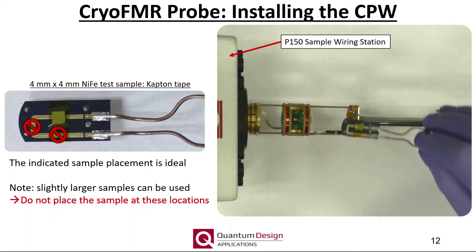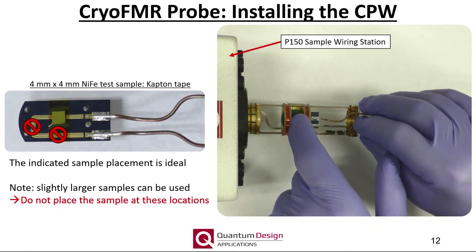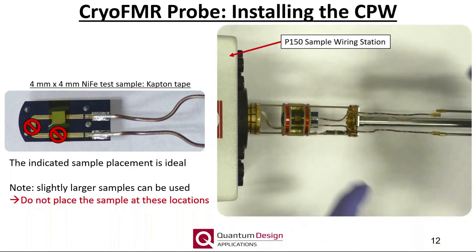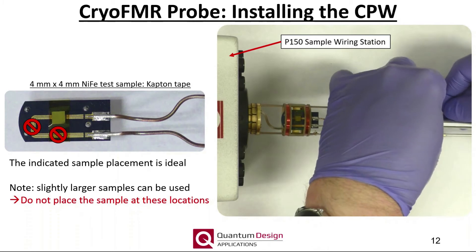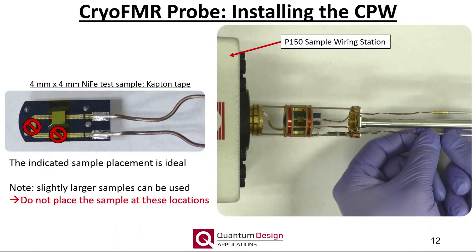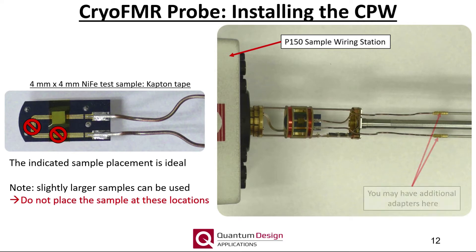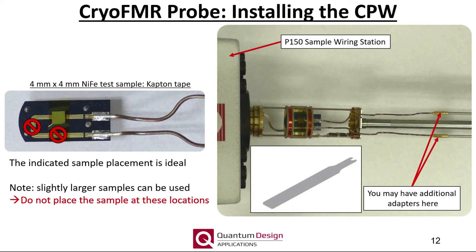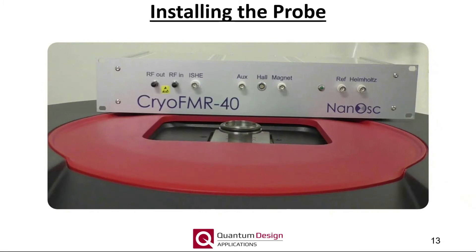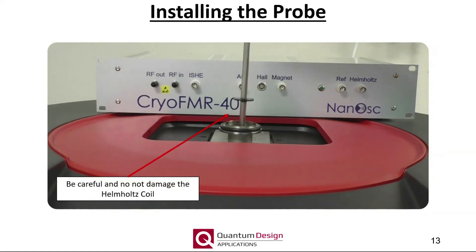Gently insert the 4 alignment pins in the coplanar waveguide into the sample platform of the cryo-FMR probe, as shown. Once firmly in place, connect the two SMPM connections, and then give all of the connections a double check. Note, depending on the vintage of your coplanar waveguides, there may be an additional adapter located here. To disconnect these SMPM connections, feel free to use the included tool, shown here, to gently pry the connections apart. With the coplanar waveguide in place, the cryo-FMR probe can be installed within the PPMS, more specifically the Dynacool, as I show here. Be careful not to catch the Helmholtz coils at the top of the sample chamber, as this can damage them.